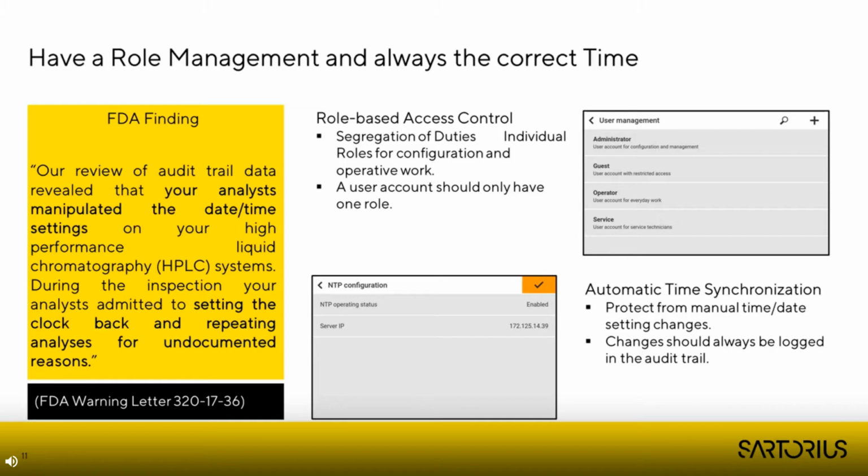Role management should also be customizable so that the roles and the linked rights can be adapted to your company needs and to the related SOPs. This example also shows another important point, the importance of the correct time.